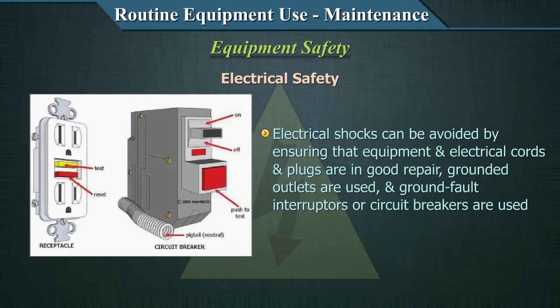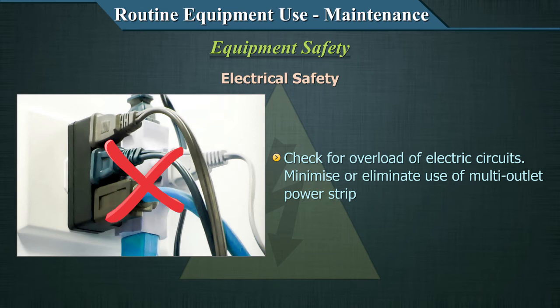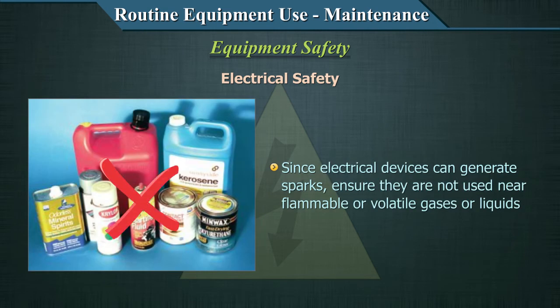Electrical shocks can be avoided by ensuring equipment and electrical cords and plugs are in good repair, using grounded outlets and ground fault circuit interrupters, checking for no overload of electrical circuits, and minimizing use of multi-outlet power strips. Extension cords can cause overloading and should be used with caution. Since electrical devices can generate sparks, ensure they are not used near flammable or volatile gases or liquids.